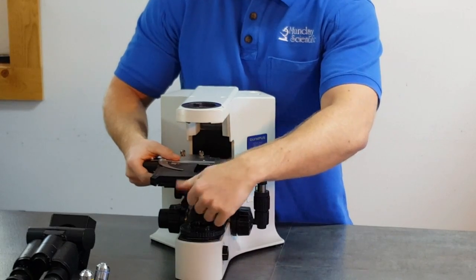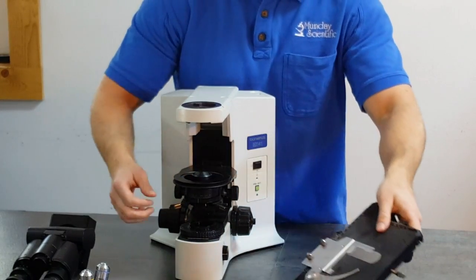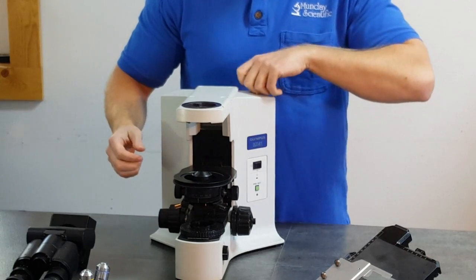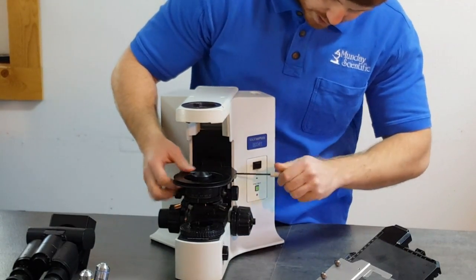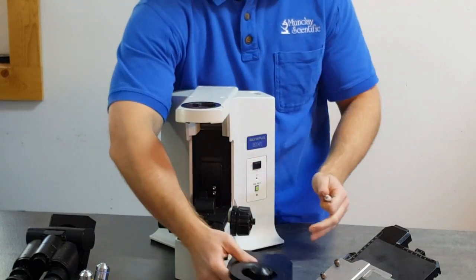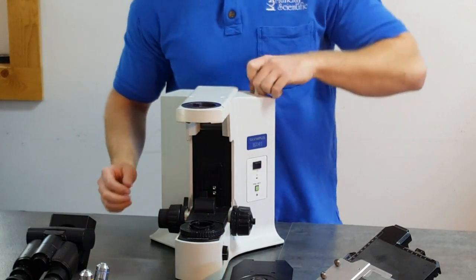Next, take the stage off by loosening the stage screw. Grab the wrench again and remove the stage bracket and condenser. Put the wrench back.